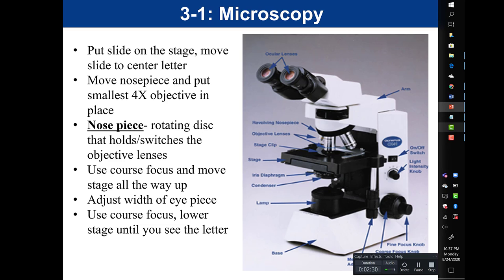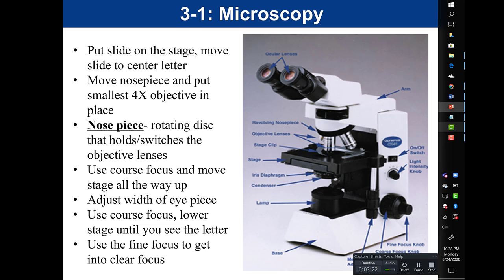Look in your microscope and use the coarse focus — the bigger knob closer to the base — to lower the stage until you can see the letter E in the ocular lenses. Once you begin to see the specimen, switch to the fine focus knob to fine-tune the image. The coarse focus moves the stage up and down quickly; the fine focus moves it much more slowly. Start with the coarse focus, then fine-tune with the fine focus.